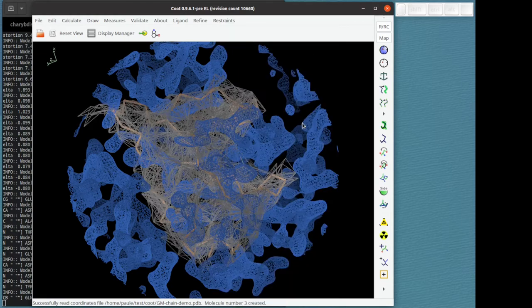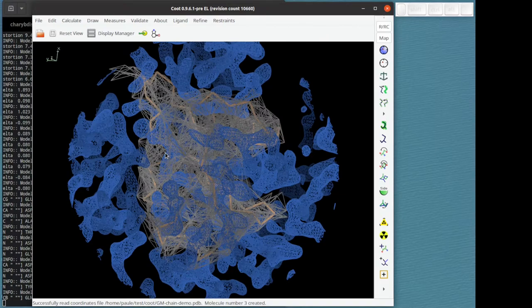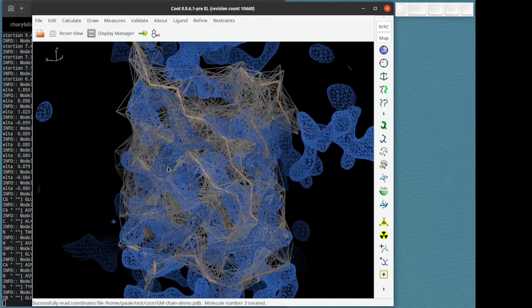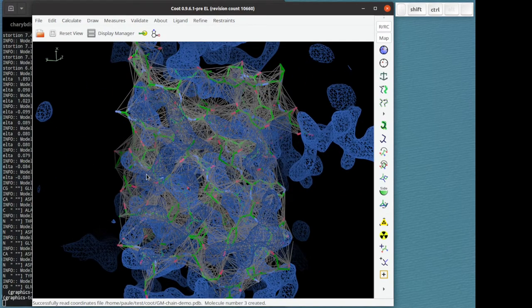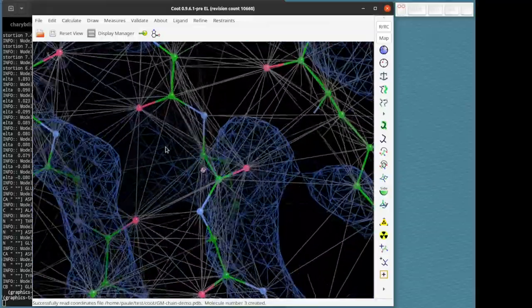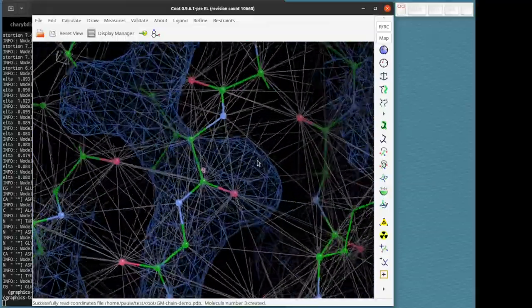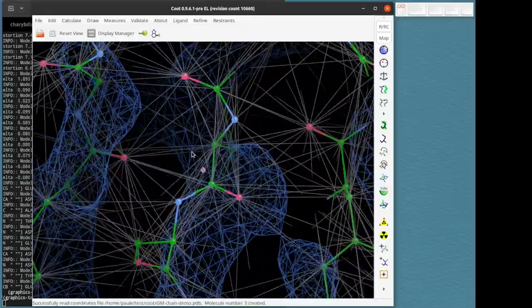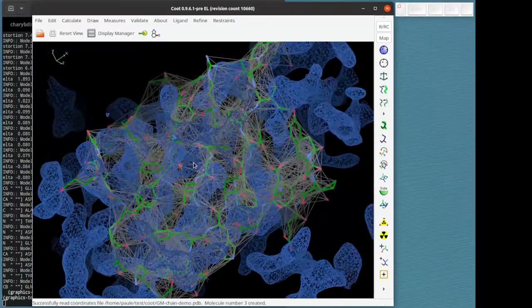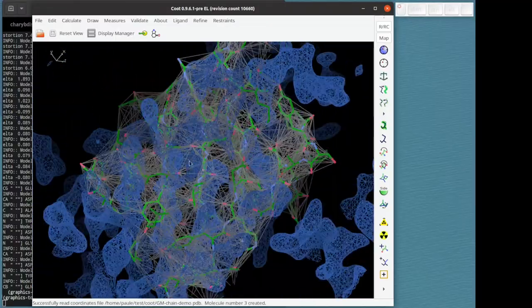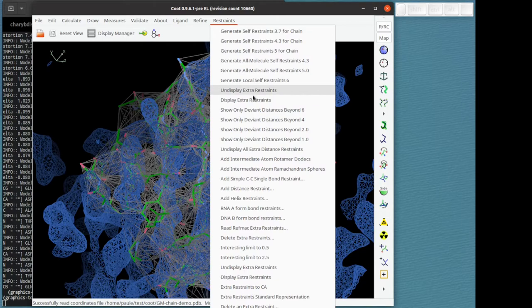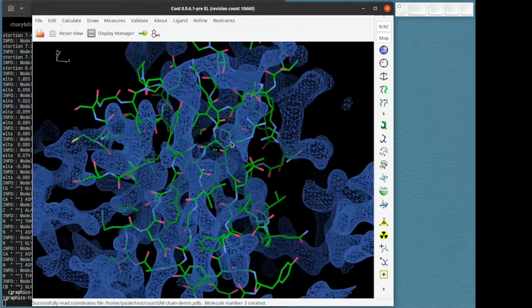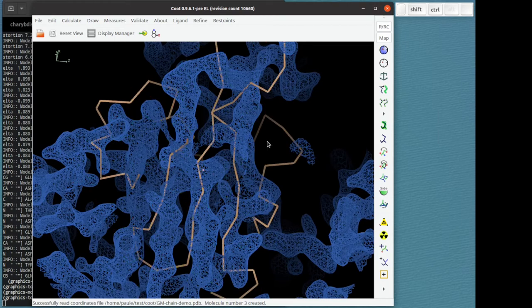So click on that and we get this mesh of extra distance restraints. So let me go to full atom mode. You can see that they are distances between atoms in the local environment. I find it easier to understand if I undisplay them and just remember that they're there. And I'm going to turn it back into C alpha mode.